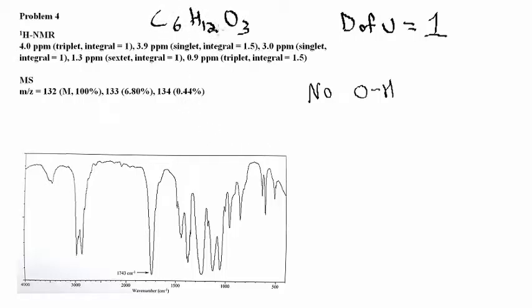There are no nitrogens. The degrees of unsaturation here is just 1, so we don't have a triple bond, but we don't see the terminal alkyne stretch in there anyway. Also, as confirmation, we don't see the peaks greater than 3,000 wave numbers attributed to the aryl or vinyl CH stretching, so no other double bonds in this compound. We do, however, see the alkyl CH stretches present, just lower than 3,000 wave numbers.